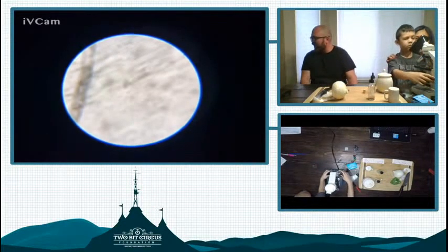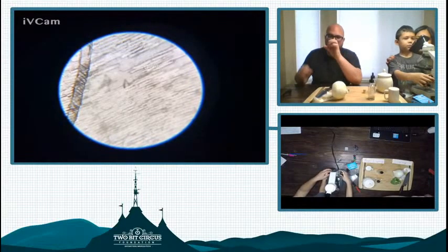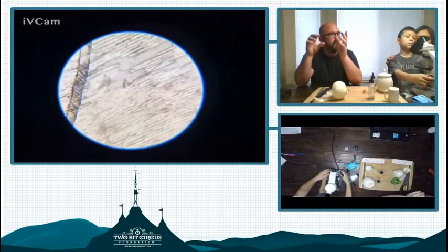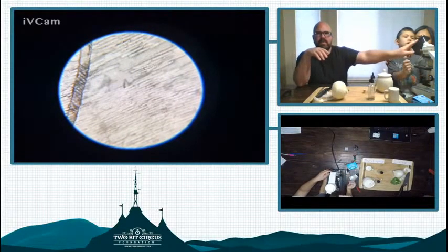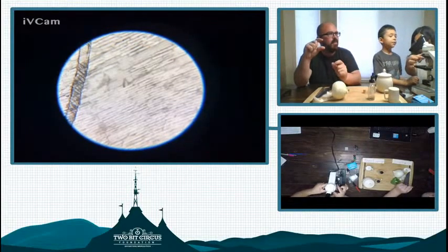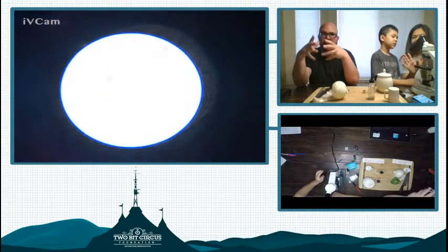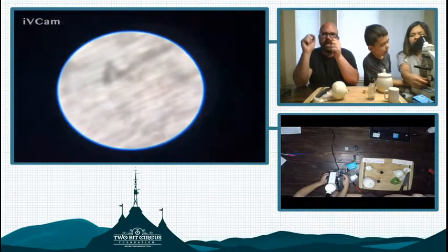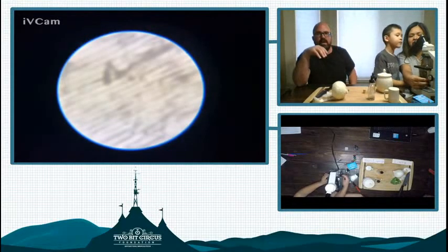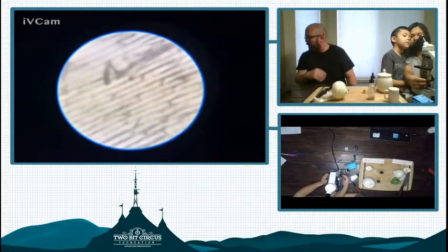I think it's really awesome that you can show the microscope like this. In the old days, you used to have to look through the eyepiece, but nowadays you can hook up a device. We have a device here that looks like a bridge. You place it over the eyepiece, and I was able to connect my phone, so that I could look through the phone's camera and actually take pictures and videos of things that you see under the microscope as well. That's a pretty cool way that you could document your experiments with the microscope.